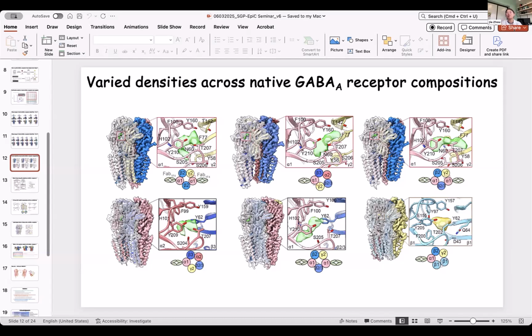That's the question that keeps bothering us. We ask the same thing: if they are true, what we see is very strong. I can give you some examples. A recently published rodent GABAA receptor, determined by just native purification, retained the native neurosteroid, even after several washes, nanodisc, and several steps of purification.